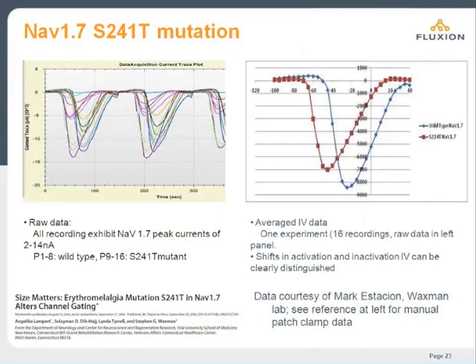Shown in the upper left are the time series plots collected as the experiment was running. Half the plate, the patterns 1 to 8, were with wild type, and the other half of the plate was with the mutant. So in real time, we were clearly seeing this difference in gating properties between these two mutants. And note also for the wild type trace that this agrees well with what we're seeing from the single cell plate. And the data also agrees well with the manual patch data that was reported for these mutants in the group's 2006 JBC article noted down in the lower left.